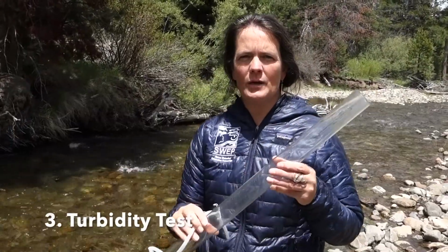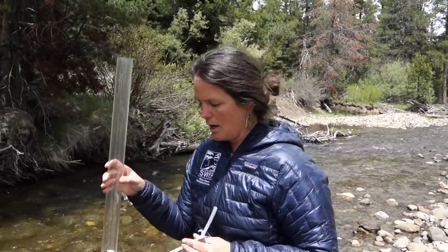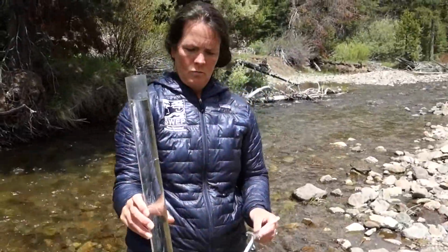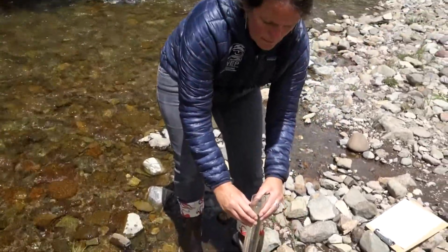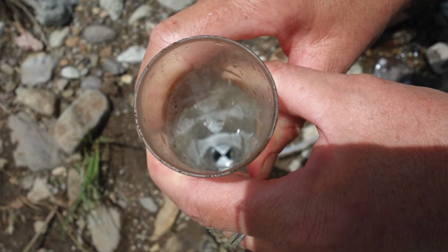Okay, so our next test is going to be the turbidity test. And turbidity is essentially the clarity of the water. There's a lot of different ways to measure turbidity. We're gonna be using the more simplified turbidity tube to help us understand the clarity of the creek water. So the way that it works is you're gonna fill the turbidity tube to the very top. And then, once you have it filled to the top, you're gonna look in over the top of the tube. And at the very bottom of the tube, there is a Secchi disc, or a black and white checked plate at the bottom. And so I'm gonna look down.